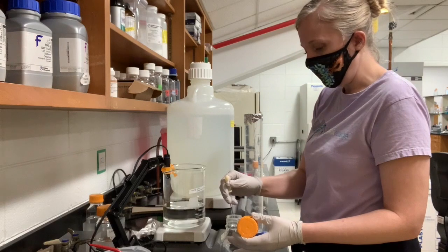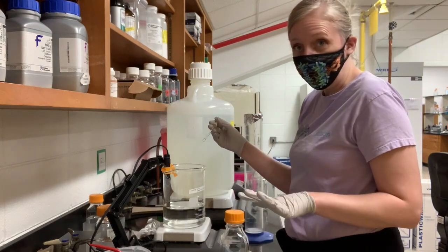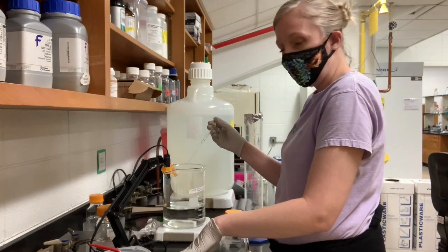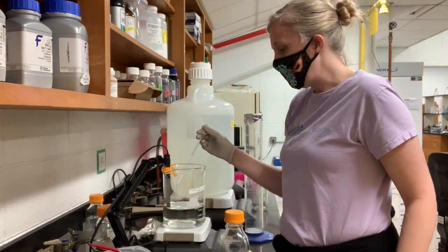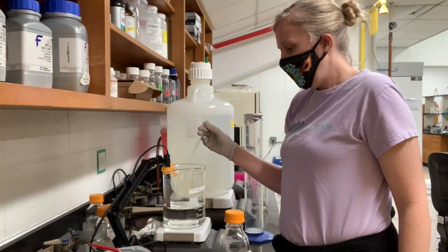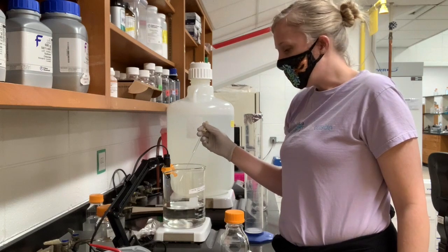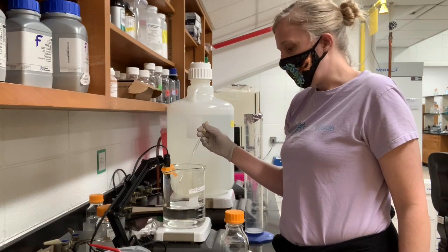I'm not pipetting it yet, I'm just ready to go. I'm going to hit measure because I want this to be constantly measuring. And I have the solution still stirring. And I'm going to slowly add drops of this strong base into my solution.